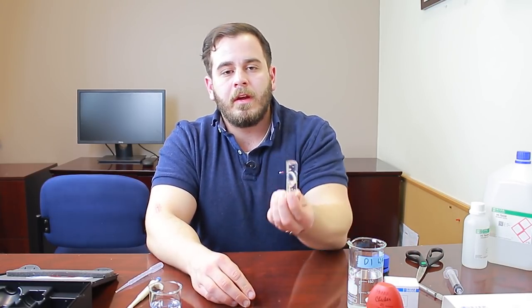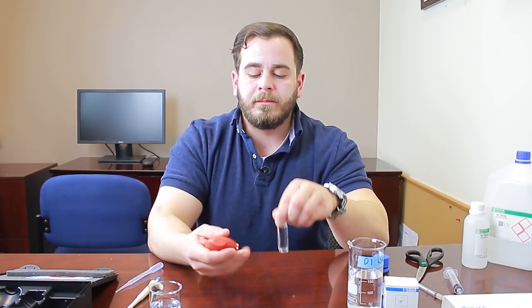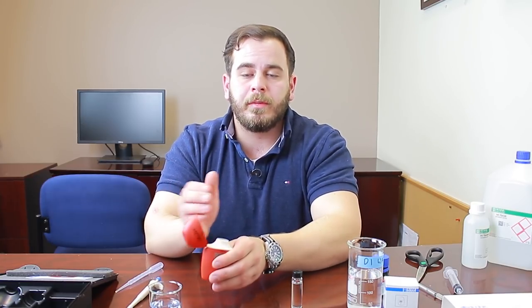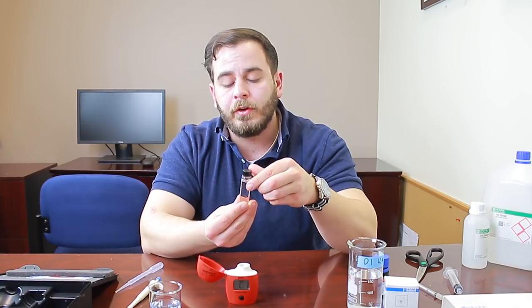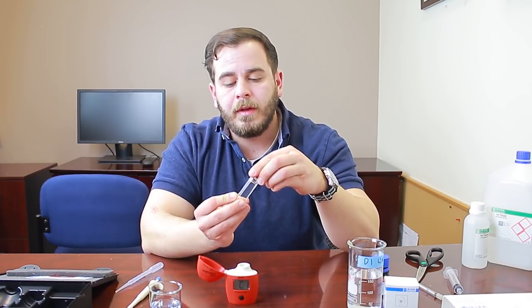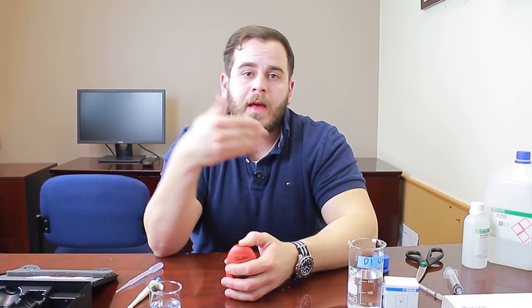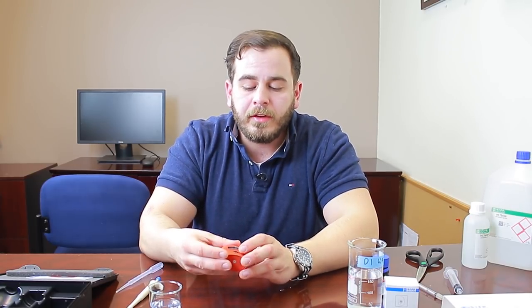Once you've added reagent A and your deionized water, recap the cuvette and invert it three to five times to mix. This gives you your blank value — a starting point without any salt water. Press the button on the checker to enter the C1 blank phase. A useful tip: face the 10 mL line marker forward each time you insert the cuvette — this is called indexing. Since rounded glass isn't always optically identical, indexing ensures the light passes through the same reference point in both the C1 and C2 phases.